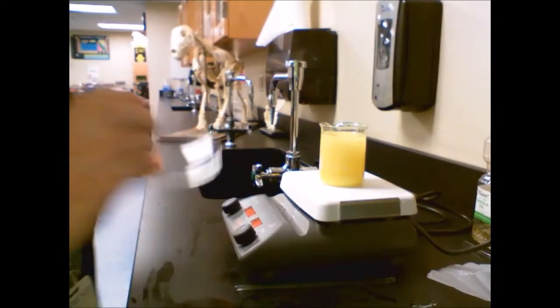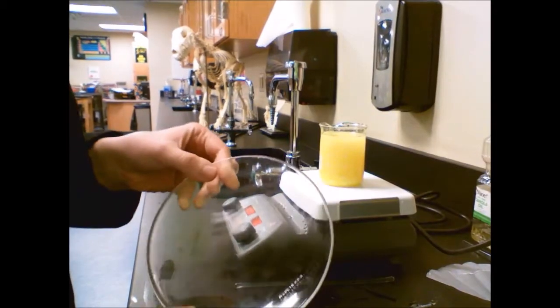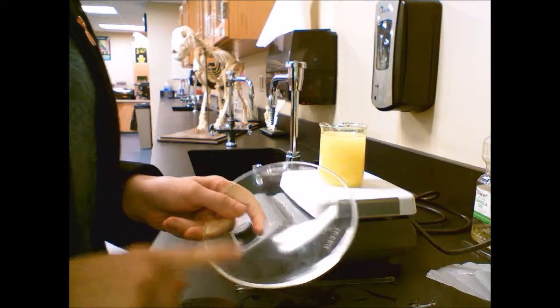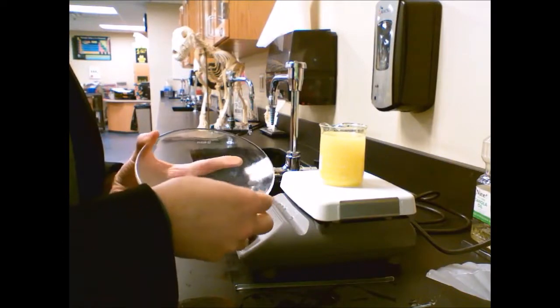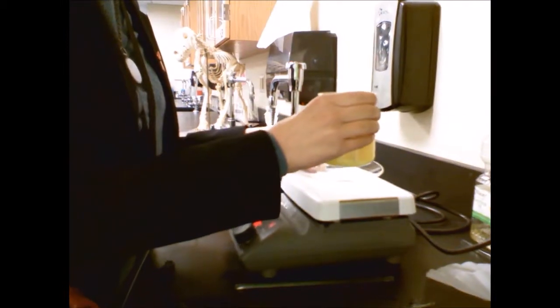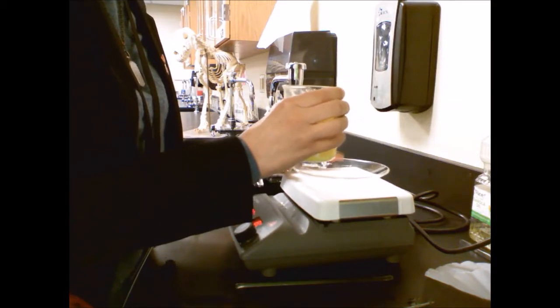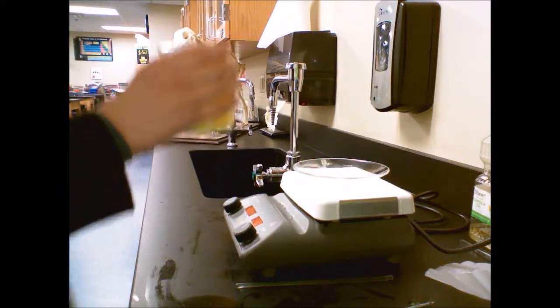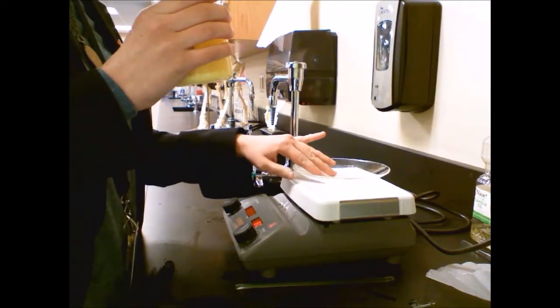I have since washed the watch glass, say that 5 times fast, which I am now going to heat on this hot plate. So I am setting this onto the hot plate. I don't need that to be stirring anymore, but I do need that to remain around 80 degrees. I'm going to wait until the bottom is beginning to feel warm already.